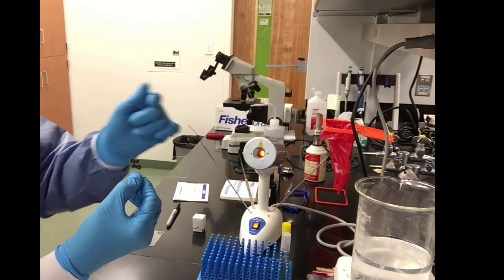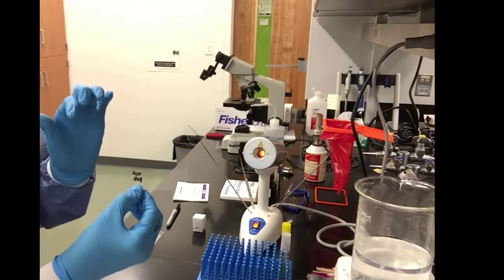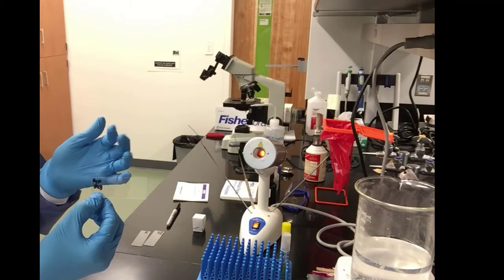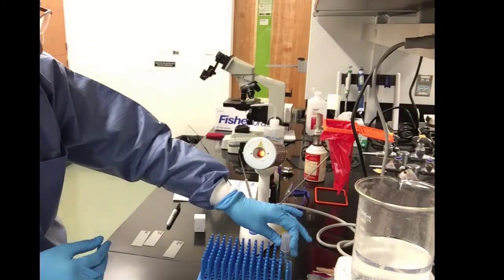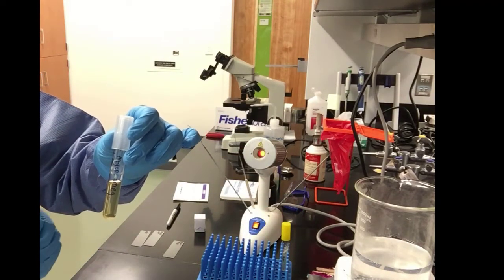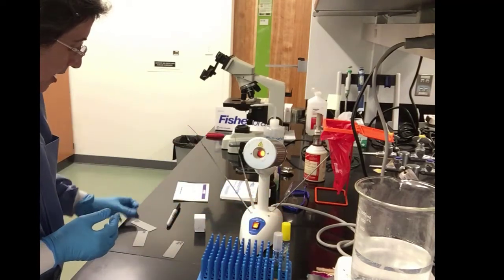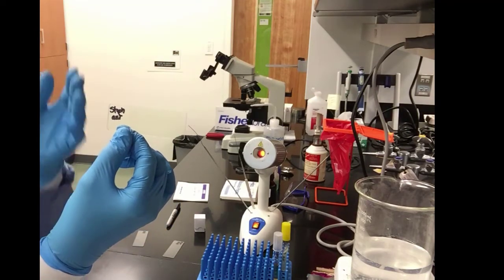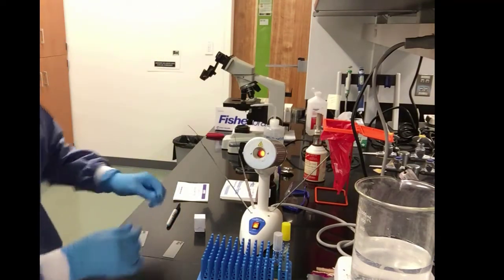Here's the way to label Mycobacterium on the left side, or you can do it on the right side, but you do not want to be in the middle because the ink from the marker will interfere with your staining and your microscopic viewing of the specimen. We will be placing this Mycobacterium smegmatis and making a smear onto this slide labeled Mycobacterium. The next slide, again, we want to stay to the left side, is our Staph aureus slide. We want to make sure we don't go in the middle and interfere with the staining and the microscope view.